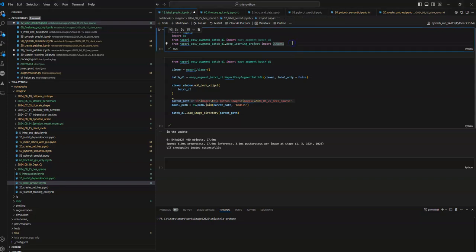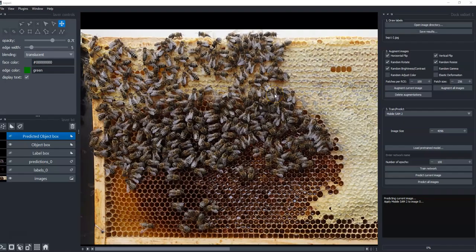So I think in my last video I showed this, the plant roots. I used this labeler to try to improve the labeling process. And if you looked at it closely, you may have noticed that there was this label only parameter which I had set to true. So if you're brave, you can set label only to false, and then the label widget comes up with a bunch more options, and it becomes an augmentation plus training plus prediction plus labeling widget. Very experimental. A lot of the functionality is not implemented yet. So again, if you try this super mode, take a lot of care.